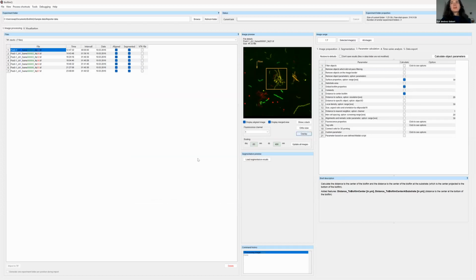Okay. So I'm going to calculate these three properties. I think I'm over my time. I'm sorry for that. If it's okay, you're free to stay. I'm going to talk a bit more about how you could continue with this kind of thing, but it's not going to take long.